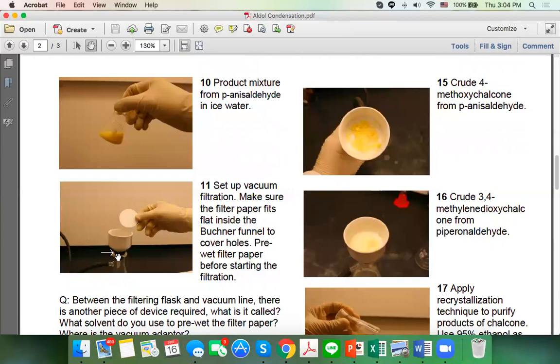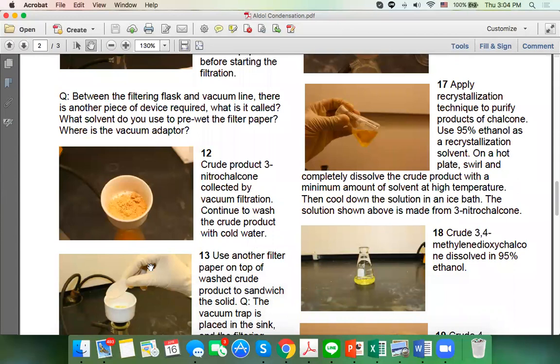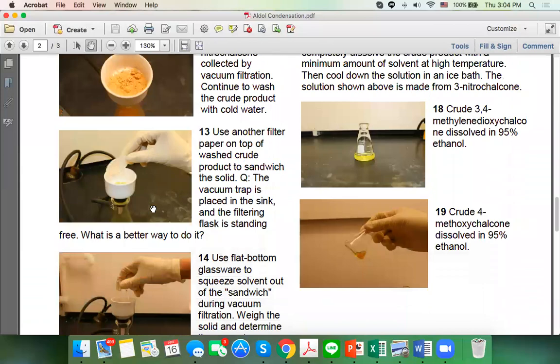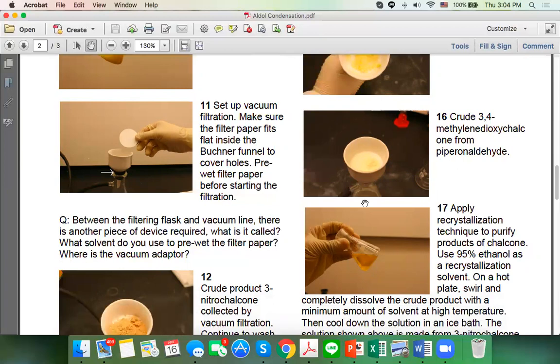It is a theory we want you to learn. That reaction and the mechanism plus that UV spectrometer, okay, these are new to you. And we want to emphasize your understanding from what you learned from the lecture, okay? Look at this, okay? Crude product, if it has a nitro group, okay, it gives you this beautiful peachy color, okay? And then the others are more yellow or white, okay? Like this, it's more yellow or more white. That means it is off-white, depending on your starting benzaldehyde, okay?